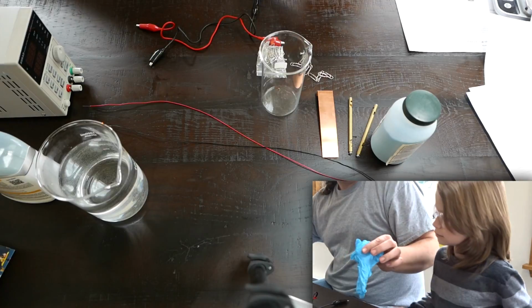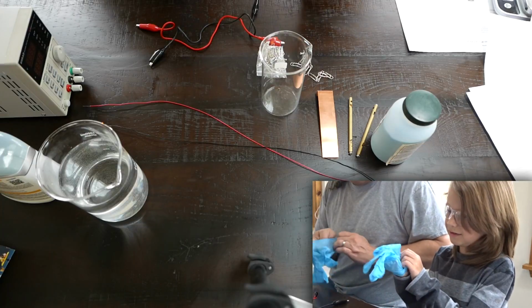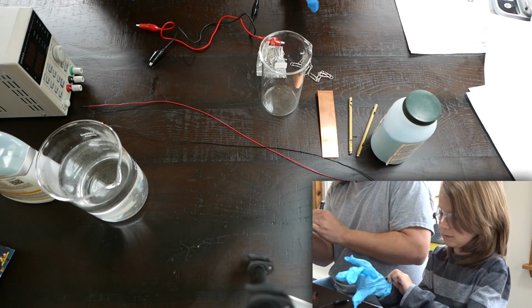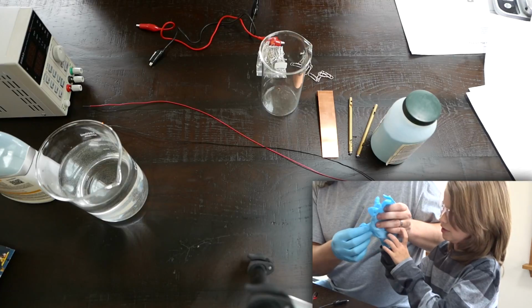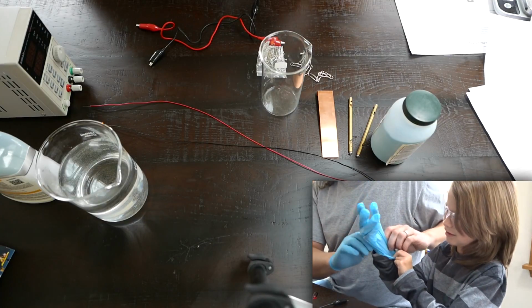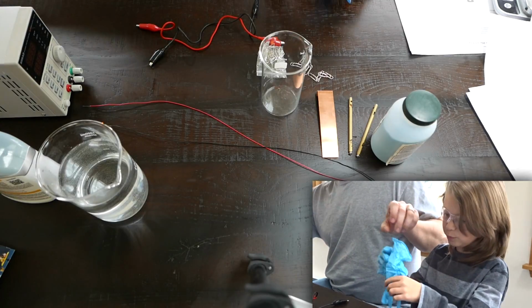And we're gonna put some gloves on. Very important. Once we put the gloves on, do not touch your face, okay? You've been touching your glasses and whatnot and fidgeting, so don't do that anymore, okay? Yeah, I know. Do your best. I know they're not meant for you, but. I'm trying to get them on. You got your pinky. You're good. There is my glove of power. Right, you get another one there?